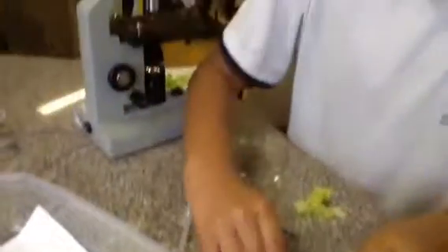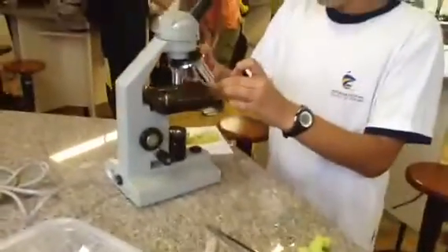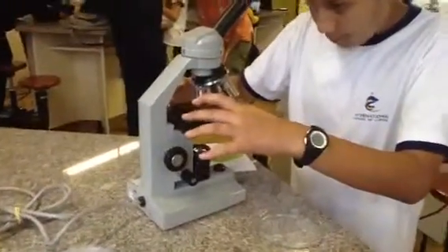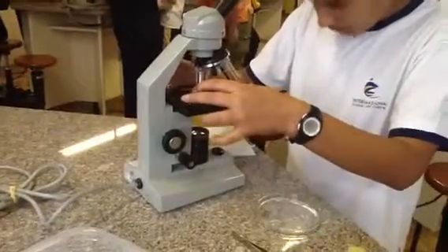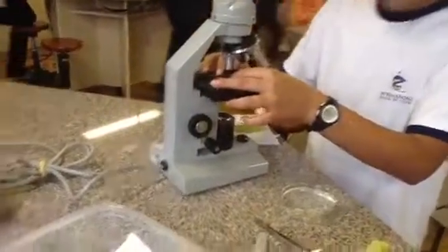Now we're going to press it down. Next thing we have to do is put it on the microscope. We're going to slide it here, pick up the two stage clips and then just slide the slide right on here.